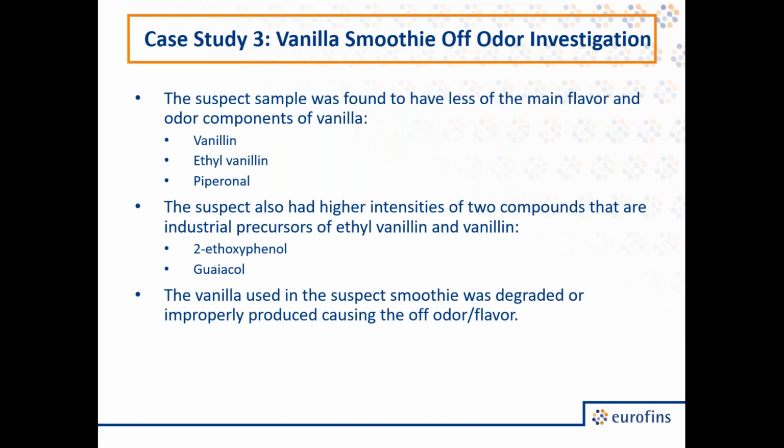So in this case, this is an ingredient issue where the vanilla that was used in this bad batch was either degraded or potentially not properly produced, which led it to not be fully reacted. So we were able to inform the client, and they could remediate their issue by getting some fresh vanilla extract.